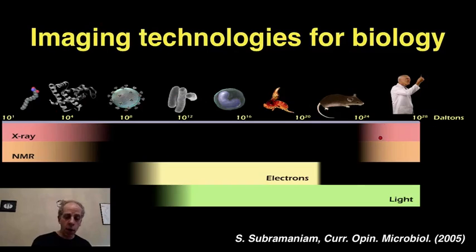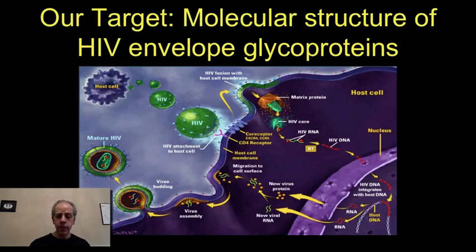During this video, we are interested in viruses. And then we're going to be talking about nanometers or Angstrom scales. And in particular, what we're going to use is not light, we're going to use electrons to acquire our image, because we are at a very small scale. Again, in the orders of nanometers and Angstroms.